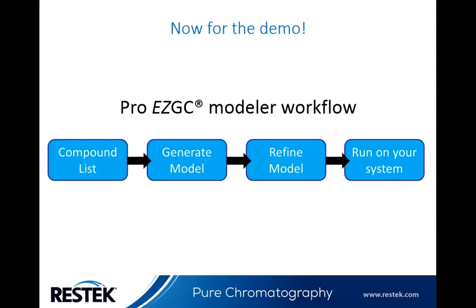So now for the demo. This is going to be just a very quick demonstration of the power of the ProEasy GC modeler. In video two, we'll actually go more in depth on the basic use of the modeler. The workflow of the modeler pretty much mirrors the workflow in the development of a chromatographic method. We start with a compound list, then generate our model — basically like doing our initial runs. We refine our model, which is optimizing our runs. And then once we have a model that we like, we can purchase any columns or standards that are needed and run it on our system.